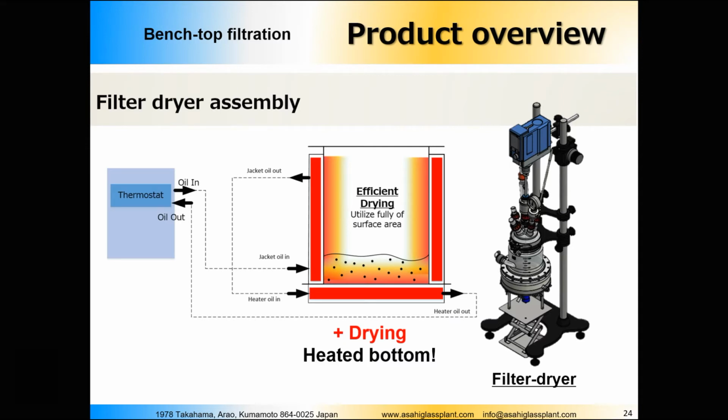from the exposure of the atmosphere, or from the apparatus that can damage it somehow, or the other way around, to protect the apparatus from the substance. So in this case we will get the dry powder in the end, and that is very important. Why do we have the overhead stirrer here?